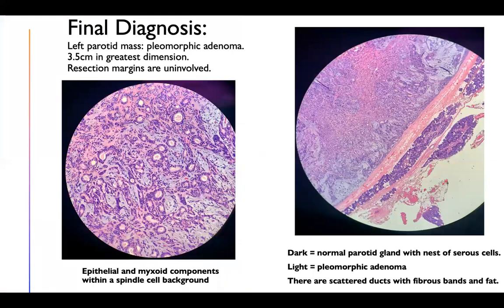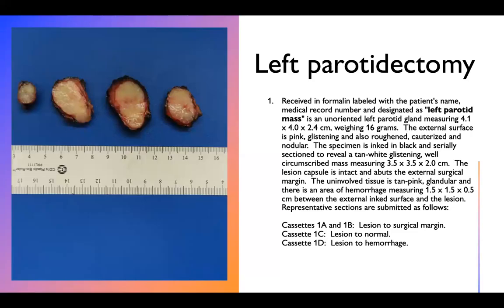So you can see how, sorry, I keep going back and forth. You can kind of see how the pathologist assistant really plays a pivotal role in how slides are made and how the sections that come out for the pathologist to read can either be really, really good or really bad. If you don't have the right person picking the right sections and knowing what they're looking for, your pathologist might not even get the area of interest that they should be looking at. So we go through a lot of training for this.